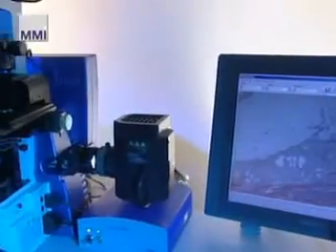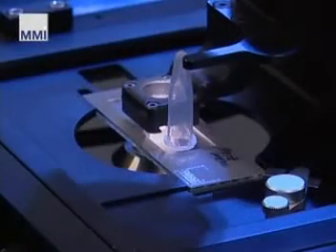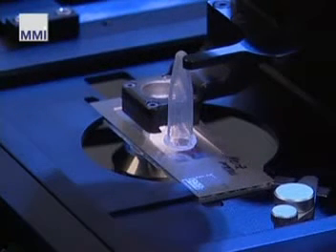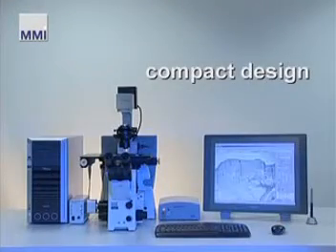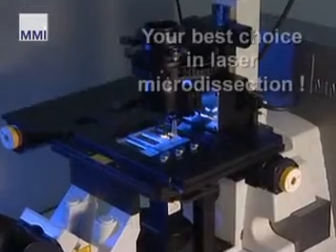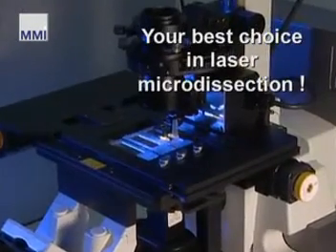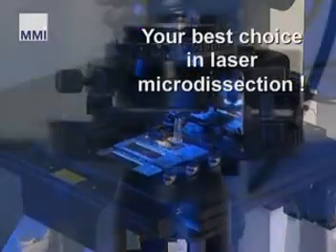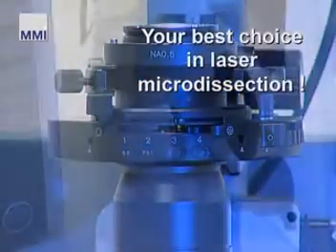The cutting-edge solid-state laser technology is directly connected to the microscope, creating an exceptionally stable and maintenance-free system. With a similar footprint as a routine microscope, the design of the MMI CellCut integrates high-precision, robust mechanical components and proven optical systems into a long-lasting laser microdissection system.